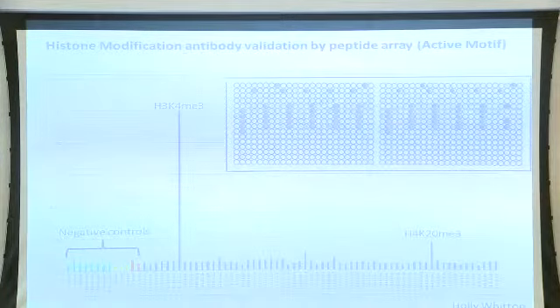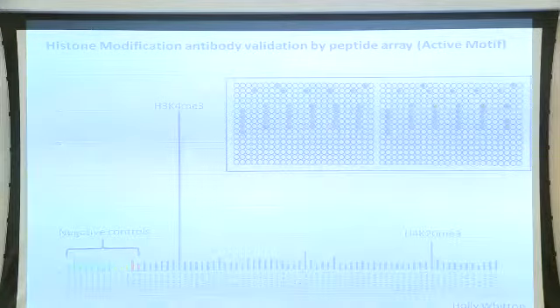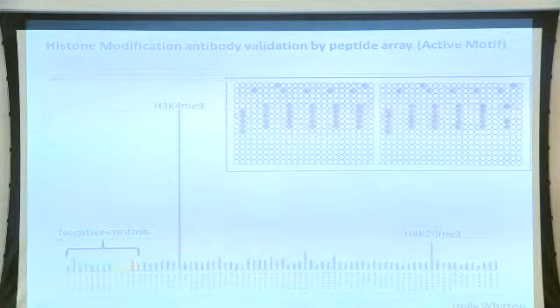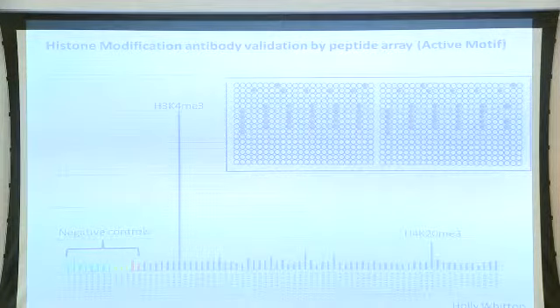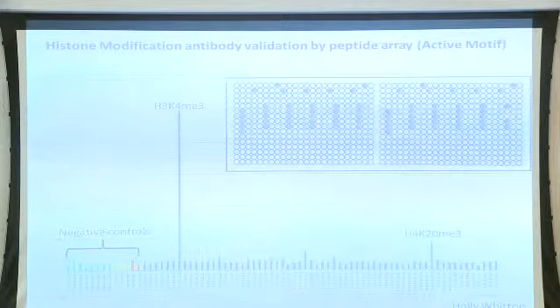These peptides are synthetic peptides, so this assay can show us that an antibody recognizes something that might not even occur in a cell. So we're very, very happy with the specificity of this particular antibody, because in practice, it won't recognize other things in real cells.